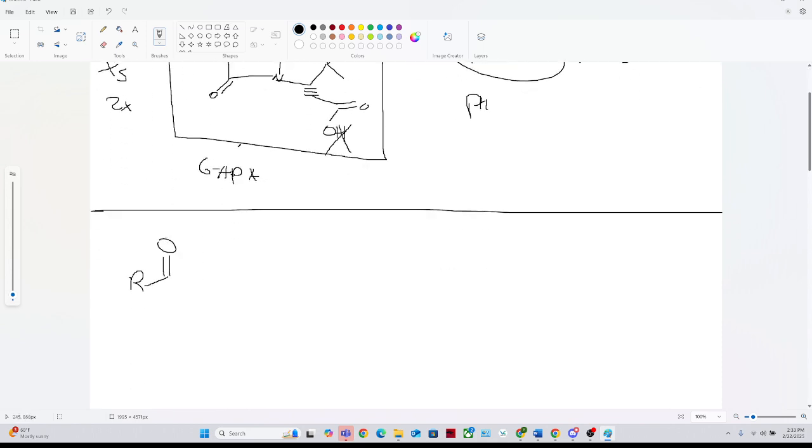So to simply just list them out, assuming that the acyl chloride is your excess reagent, you're still going to have acyl chloride remaining. I've also done a little bit of looking into what the acyl chlorides are. They're more non-polar acyl chlorides. Take my word for it. They're really just benzoic derivatives for the R group. You're going to have your acyl chloride. You're going to have H2O and acetone as your solvent.